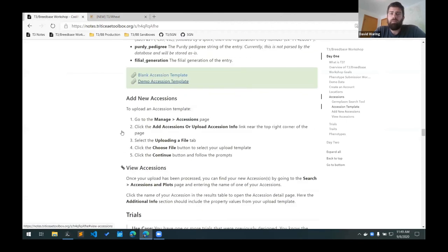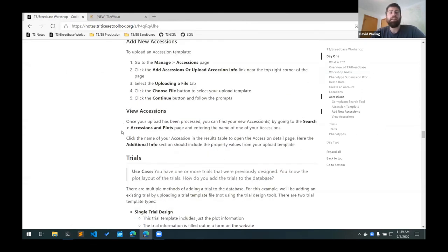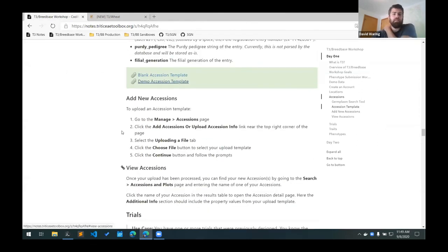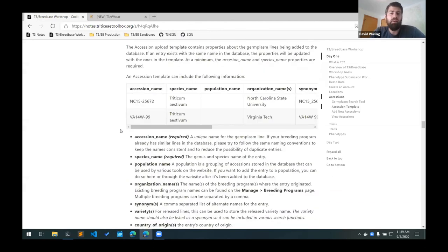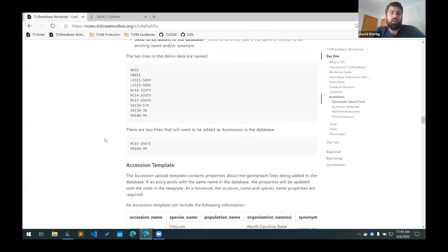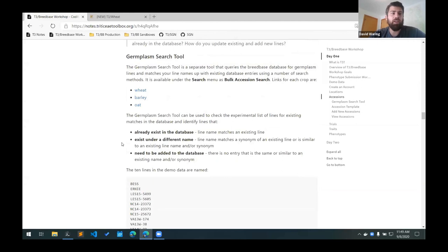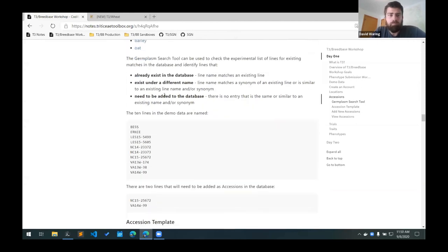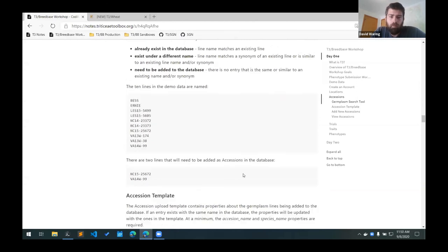All right, any questions on adding germplasm to the database? And now the trickiest part is making sure that we're not adding duplicates. So I'd highly encourage everyone to use this germplasm search tool to search your germplasm names to make sure that they don't exist in the database already.